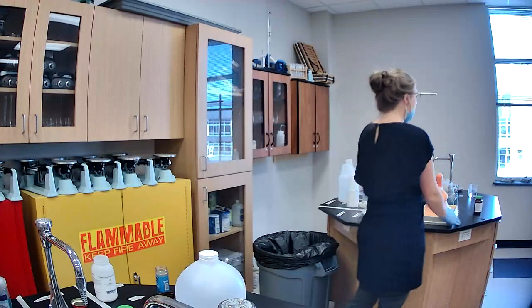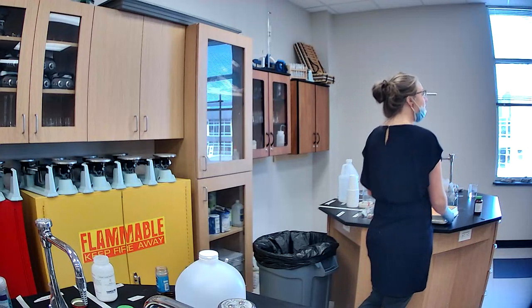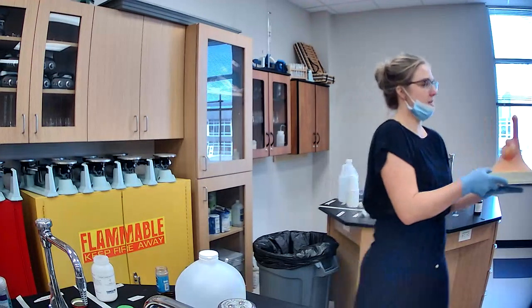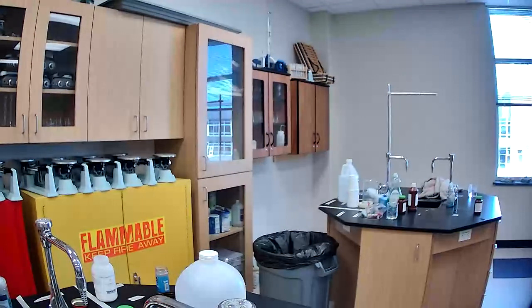I'm going to bring it around and let you feel the bottom. But listen while I explain what happened. Just touch your hand on the bottom. You'll feel it pretty hot. So the catalyst that caused the reaction actually got the oxygen to escape from the hydrogen peroxide. And as the oxygen escaped, the soap that we put in there bubbled up. That caused the foam.